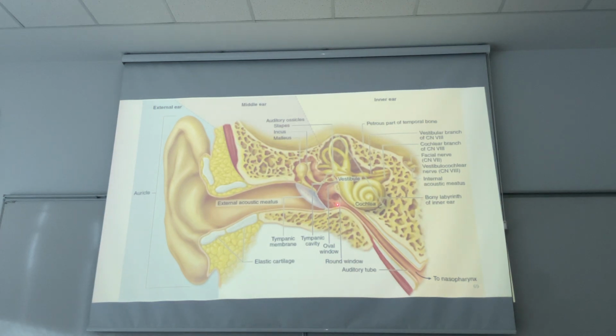And also the middle ear continues with the auditory tube and is connected with the nasopharynx. Here again we have the epithelium. Here we have simple cuboidal epithelium in the beginning, and on the other side the epithelium of the auditory tube changes into respiratory epithelium, and under the epithelium we have bony and in some parts elastic cartilage structure.